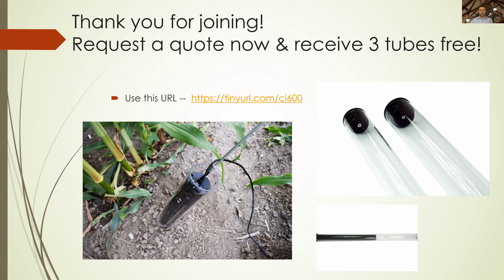The next question is, what does the tip of the tube look like? Gesturing towards the screen, you can see we actually have insulation caps on both ends, and that's what it currently has. Both of them, you see the large diameter for the 600 and the smaller for the 602.